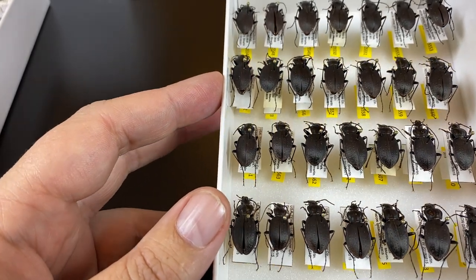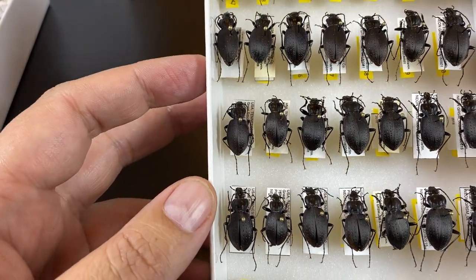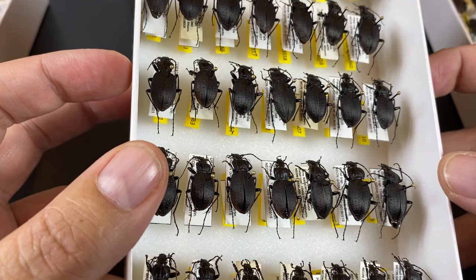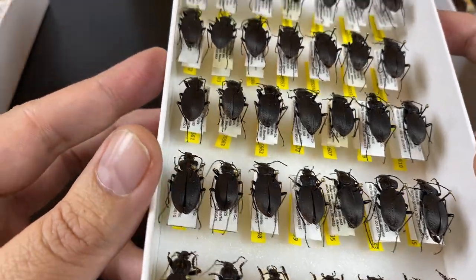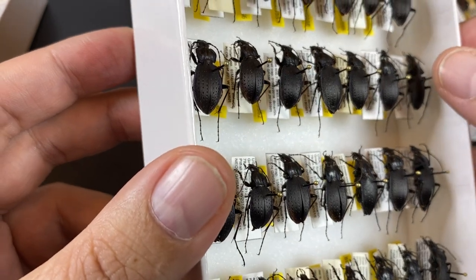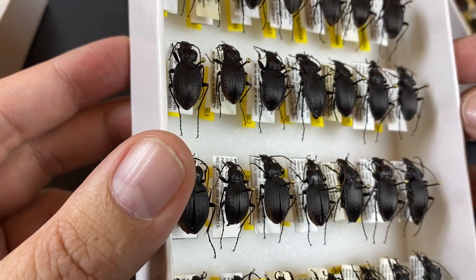When we're thinking about preservation, there are a number of things we do. This is an archival unit tray with acid-free, lignin-free paper. These are pins that are coated with black enamel to try to avoid rust.